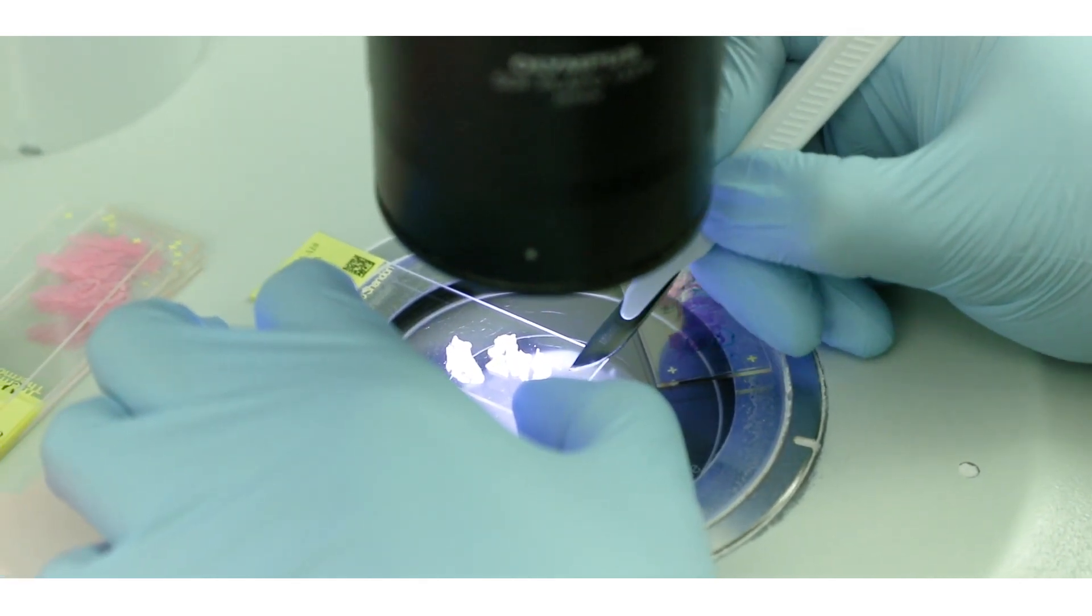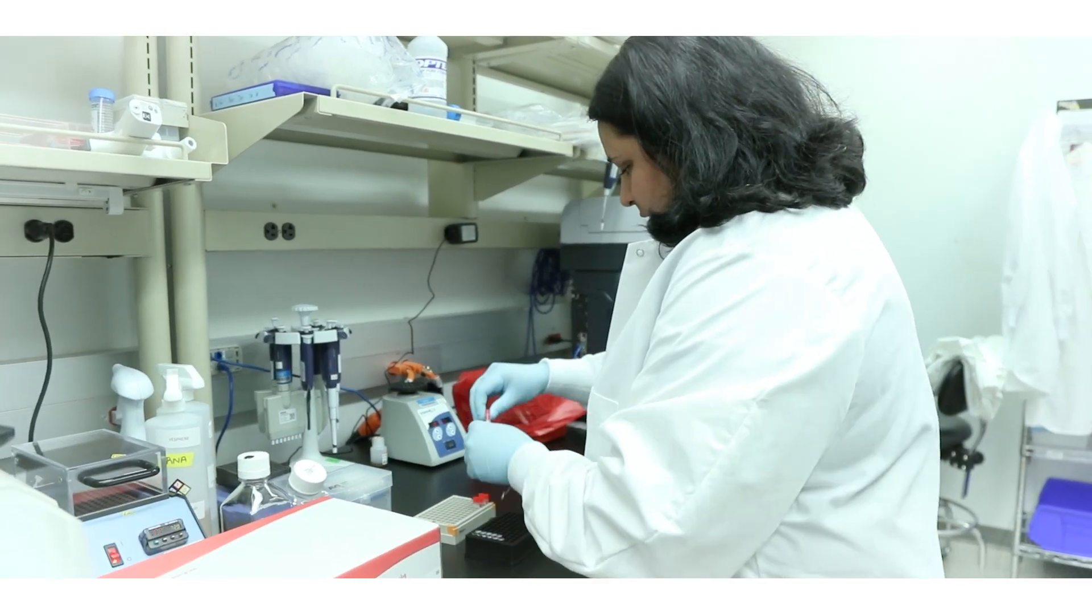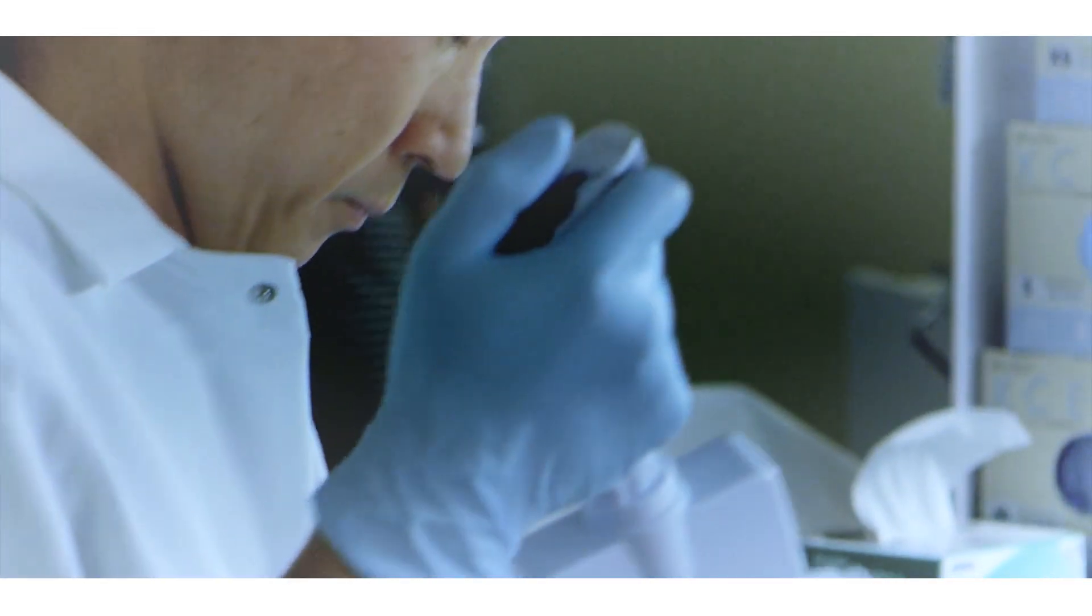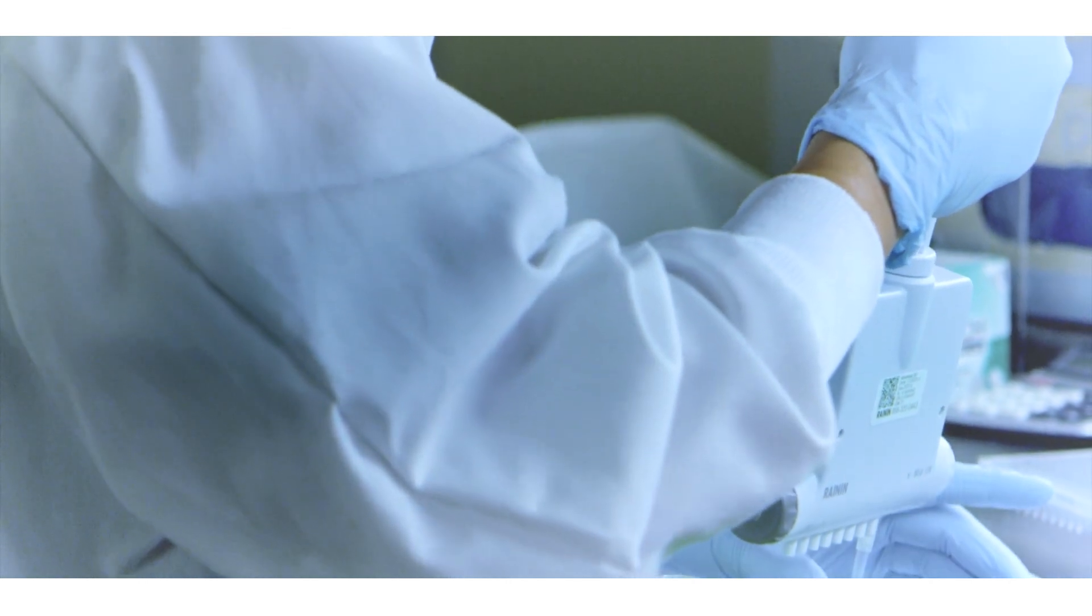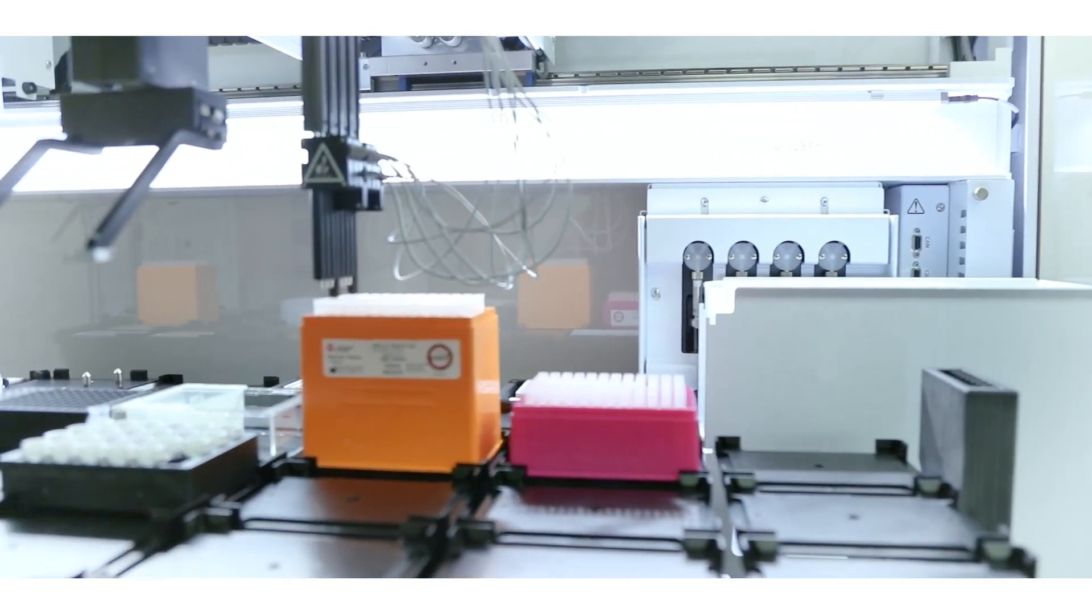Then we go into DNA and RNA extraction. So we have separate methodologies that we use in order to optimally extract the different nucleic acid material from these samples.